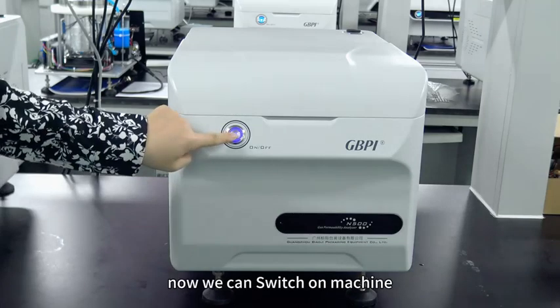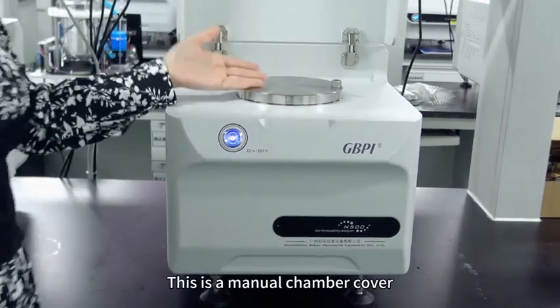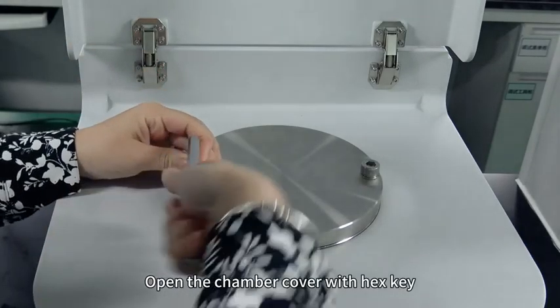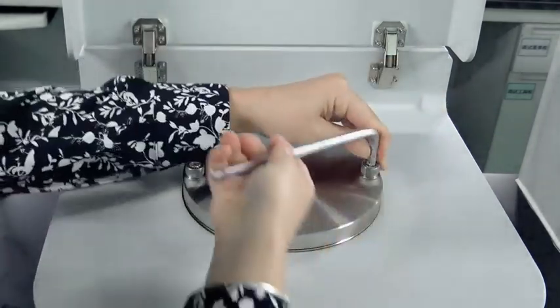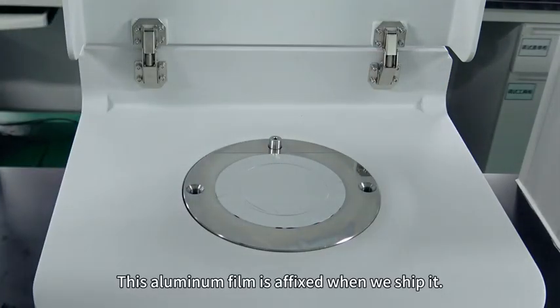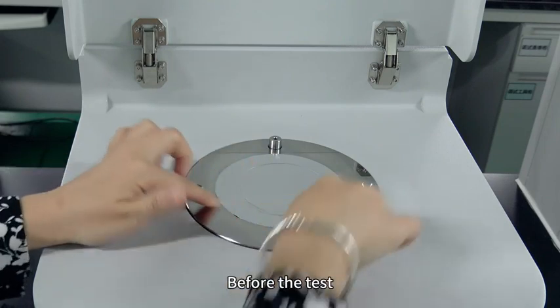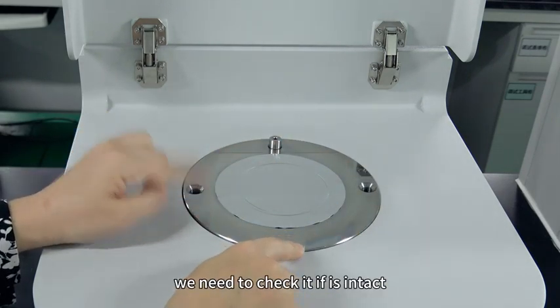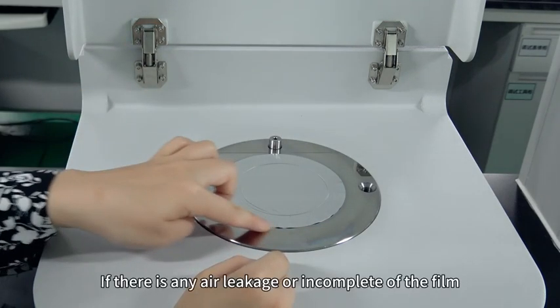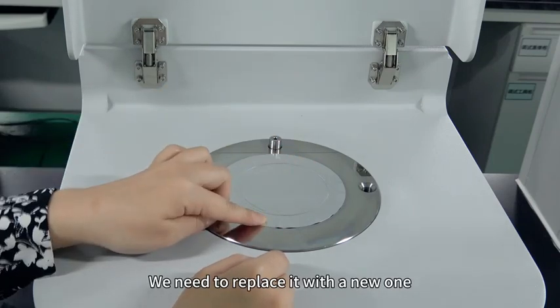Now we can switch on the machine. This is the testing chamber and this is a manual chamber cover. Open the chamber cover with a hex key. This aluminum film is affixed when we ship it. Before the test, we need to check if it is intact.